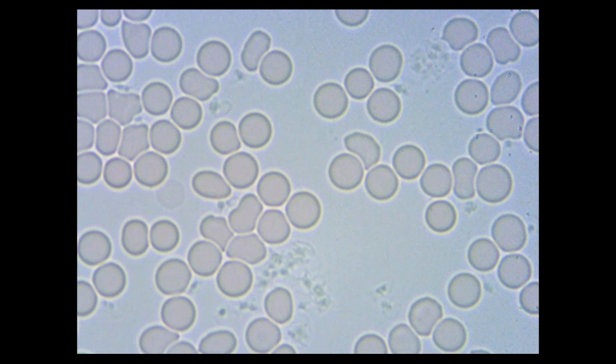Okay, and would you suggest having an annual checkup or anything like that? Well, the thing that one would need to check is just the alignment of the various components. Now, inside the microscope, everything is set in place, and there's very little chance of anything happening there.